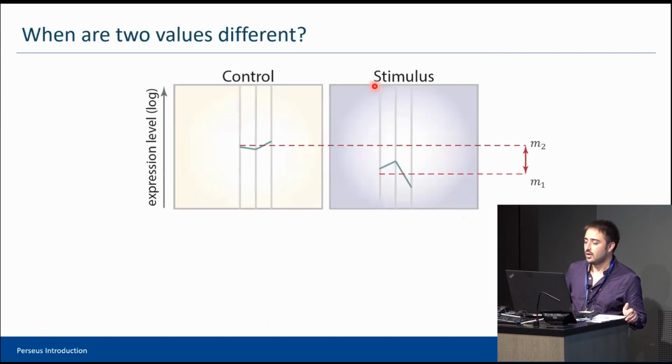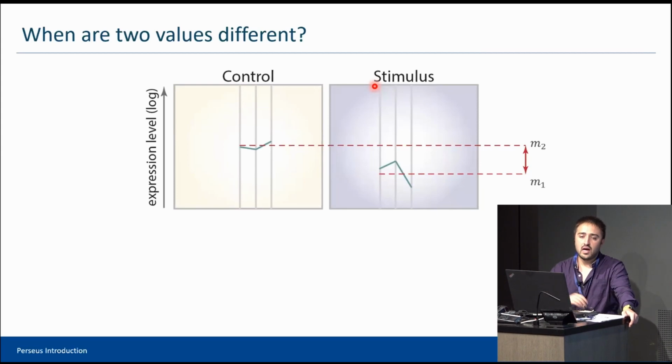Okay. So this was more or less the introduction about what the software can do, what the main references are, and what the specific use cases are. Now we will start with the theory, the statistical theory behind it. This will be the more math-driven, more precise part, where you can really understand what is behind it. So feel free to ask. I will try to go slowly here. Feel free to ask, and just don't believe that everything is like that. If you have any question, this is the moment.